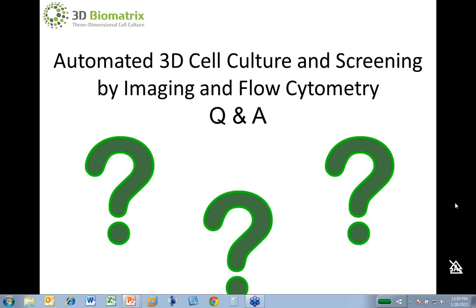Nikki, do you have anything to add to that? I would only add one thing: people are going to have to determine this for their model for the most part, and I think the key way to start is to figure out what extracellular matrix is being secreted by the cells you're trying to split apart. As Mike alluded to earlier, Accumax is trypsin and dispase. If you have a lot of collagen that you've added, you might want to add a collagenase. It can probably be done for many different types of spheroids. It's just going to take a little bit of thought and a couple of experiments.